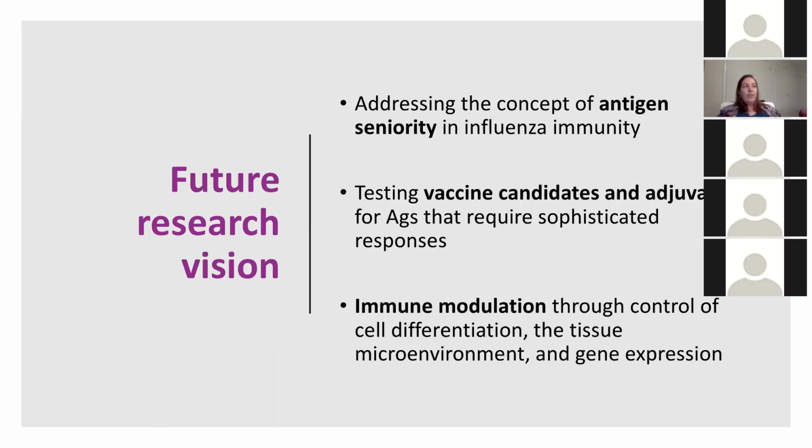And also, I think this is a good way for us to better understand immune modulation because we have more control over the cell differentiation processes, potentially the tissue microenvironment. We could manipulate things like the extracellular matrix or even gene expression, which we can provide transiently.